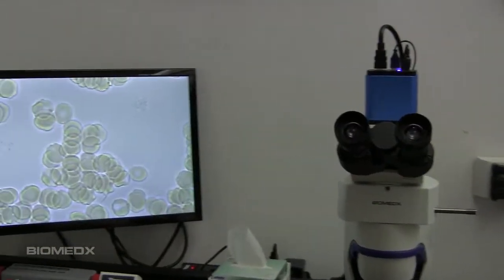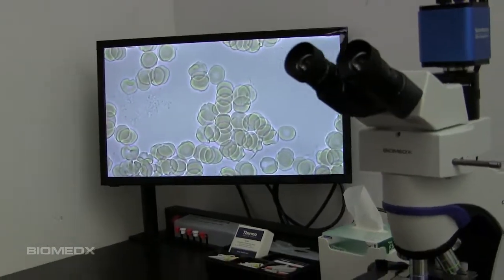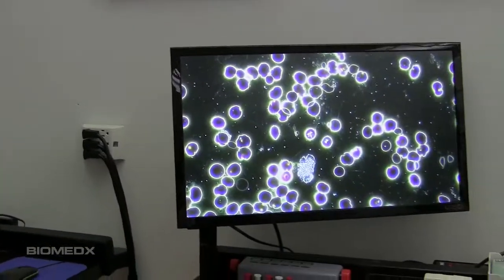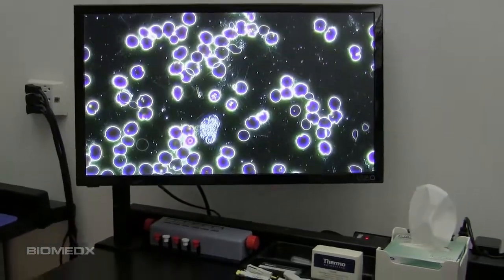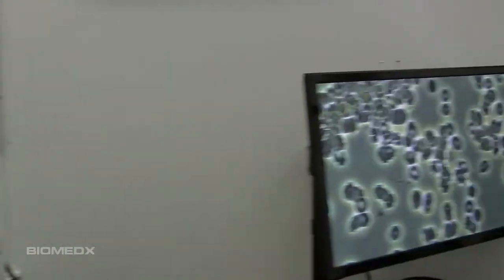This scope here, this is a live blood view under a bright field mode of the condenser. The iris is stepped down a bit to give us a bit more clarity and depth of field of the image. This is dark field. It has a rich dark black background, good definition. And again, there's no oil being used here. This is a 40x non-oil objective we're looking at.